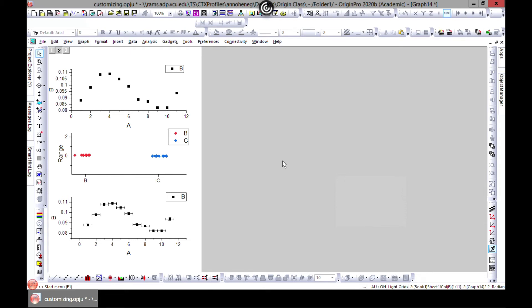Hello, in this lecture we will study how to add a graph to a graph and also how to add a table to a graph. This is very useful if you want to visualize your data or make it more interactive for your viewers.